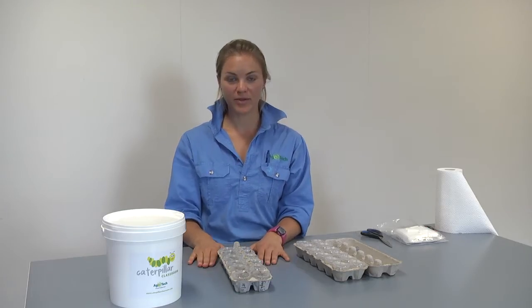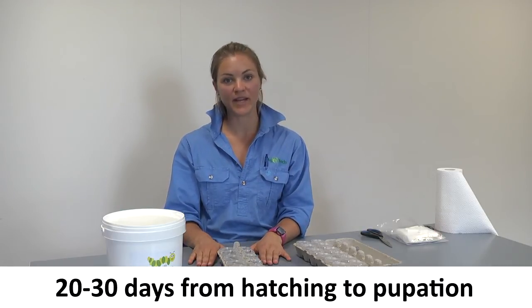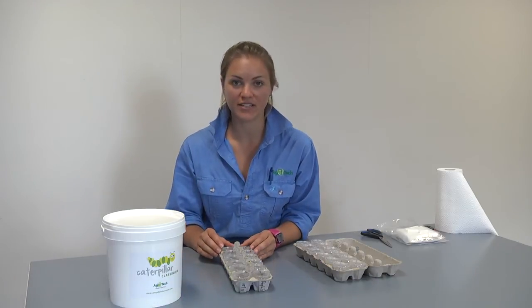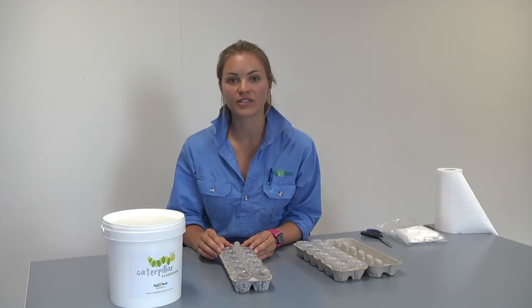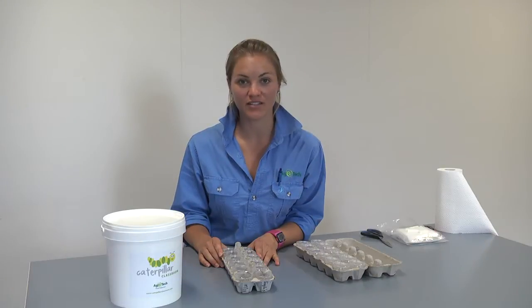During the warmer months the caterpillars take between 20 to 30 days to pupate and may take longer in winter. The caterpillar has everything it needs inside the cup in terms of food and moisture from the diet that you originally placed in the cup. As a larva reaches full size it will begin to pupate.